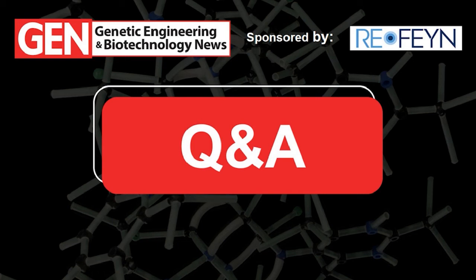All right, thank you. And how does the system handle 3D aggregates of AAV? So with aggregates, we do see them. It's a bit of the same story as with the partials. We do see aggregates. We are currently investigating how well we can quantify them. It also depends a little bit on their size, how big they are. But you can see them in the mass histogram.